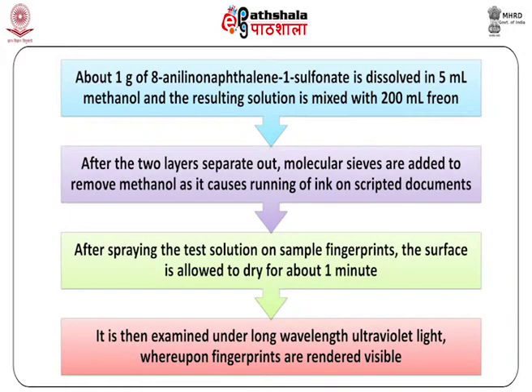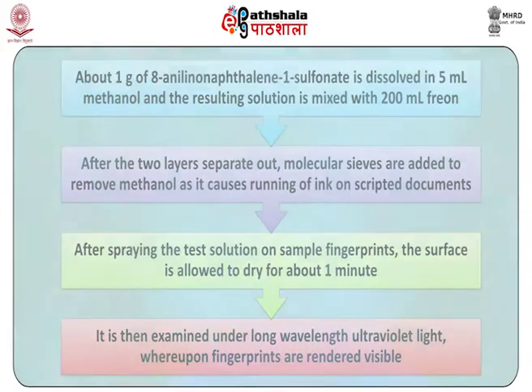About 1 gram of 8-anilinonaphthalene-1-sulfonate is dissolved in 5 ml methanol and the resulting solution is mixed with 200 ml Freon. After the two layers separate out, molecular sieves are added to remove methanol as it causes running of ink on scripted documents. After spraying the test solution on sample fingerprints, the surface is allowed to dry for about 1 minute. Then examine under long wavelength ultraviolet light, whereupon fingerprints are rendered visible.